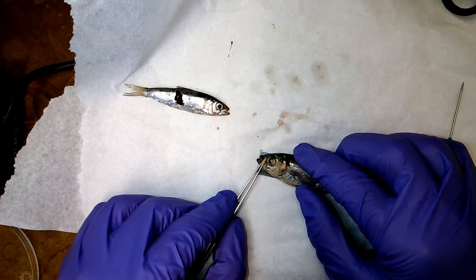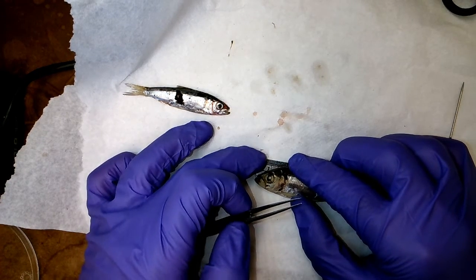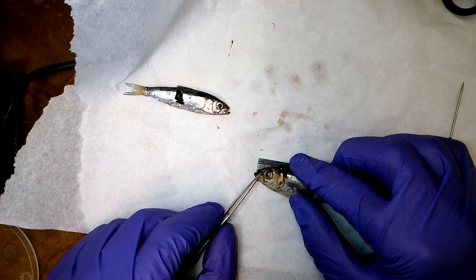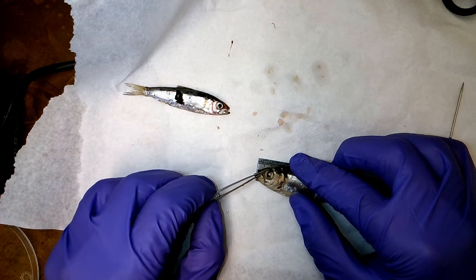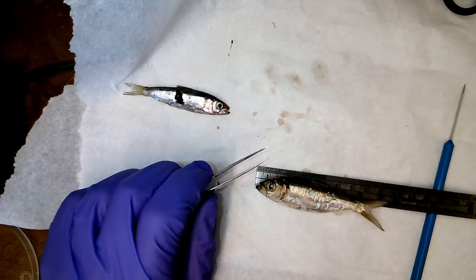You can lay it down as best you can. Make sure you can see your tick marks. And so the middle to there, I'd say about 7.5. Okay, you can call it 8 if you want. So I would have 8 for measurement A.